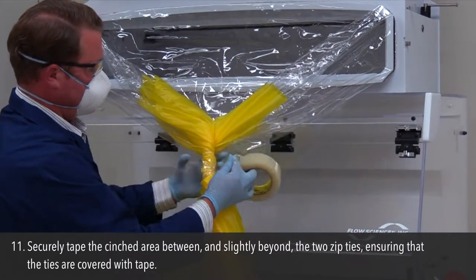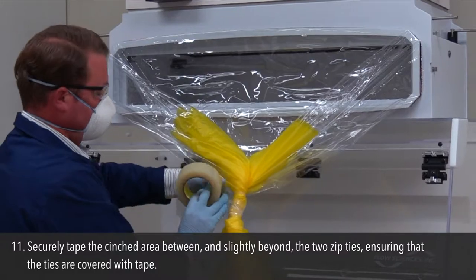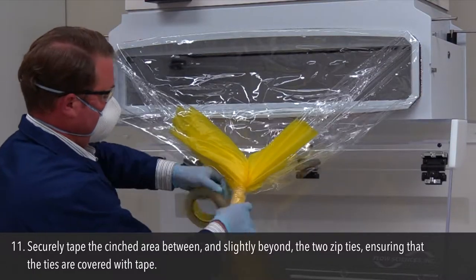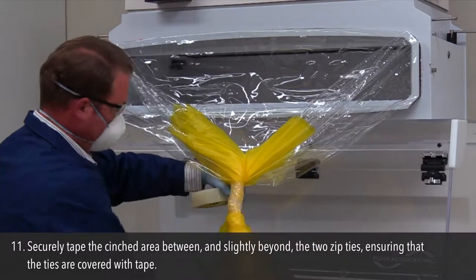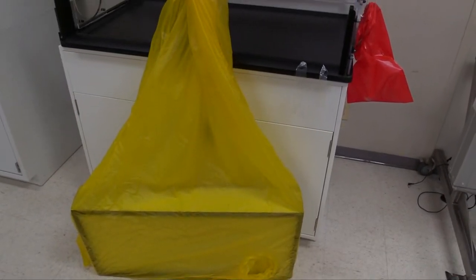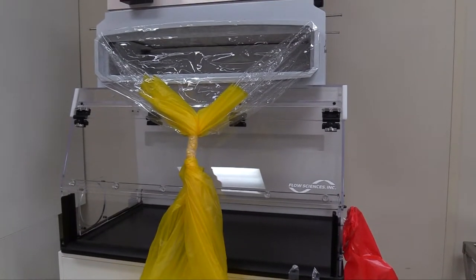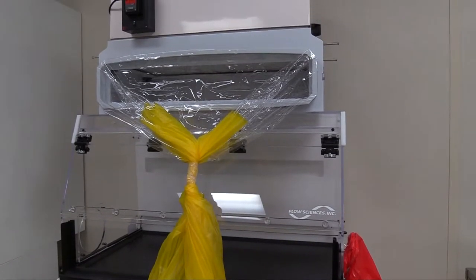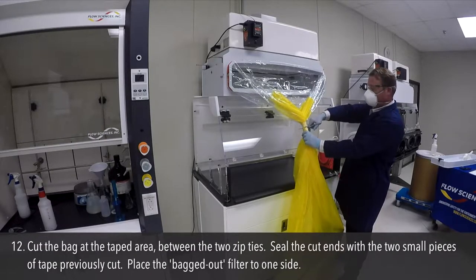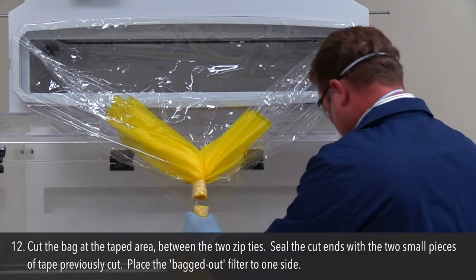Step 11: Securely tape the cinched area between and slightly beyond the two zip ties, ensuring that the ties are covered with tape. Step 12: Cut the bag at the taped area between the two zip ties. Seal the cut ends with the two small pieces of tape previously cut. Place the bagged-out filter to one side.